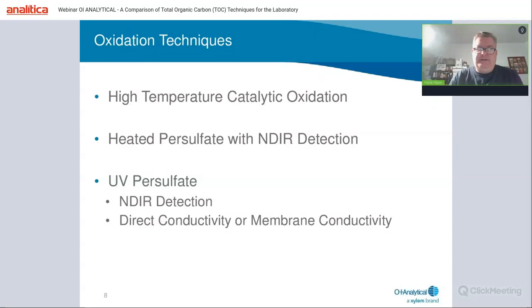So the oxidation techniques that we have are the high temperature catalytic oxidation. There's also the heated persulfate with NDIR detection, and there is UV persulfate with an NDIR detection or direct conductivity and membrane conductivity.